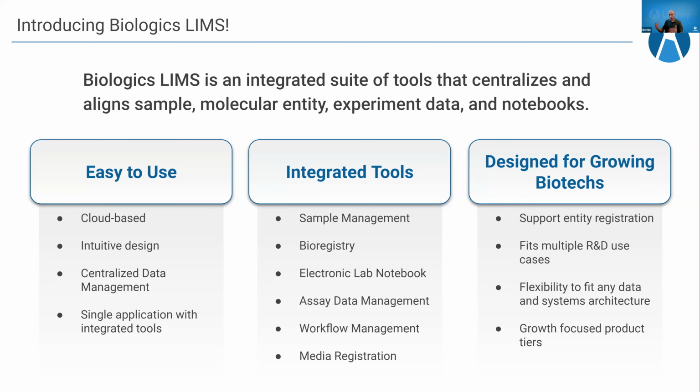All right, so what is LabKey's Biologics LIMS? It is an integrated suite of tools that centralizes and aligns sample, molecular entity, experiment data, and notebooks.